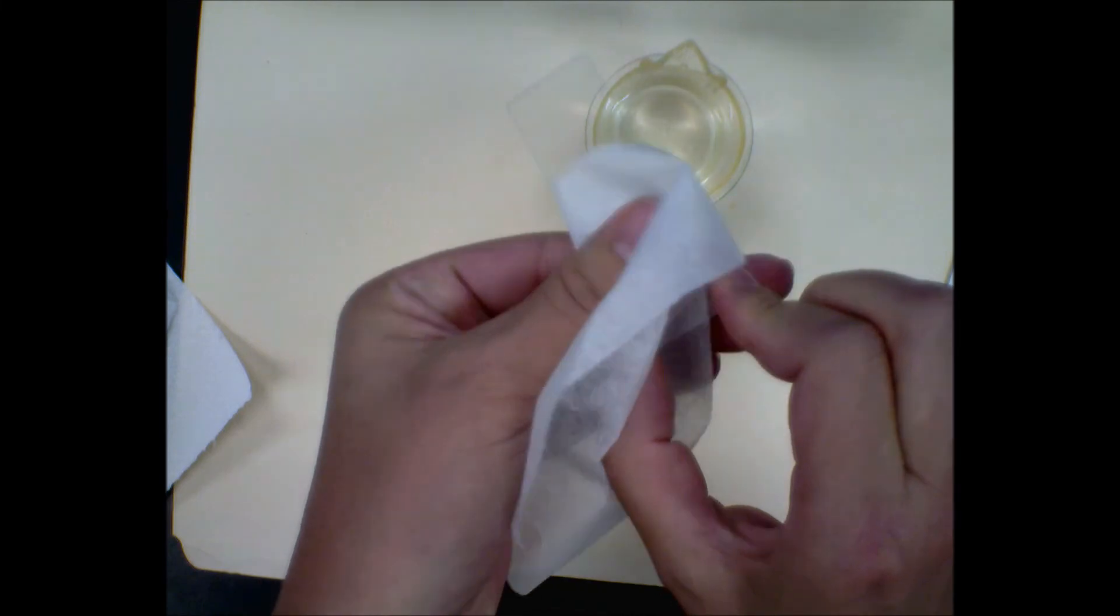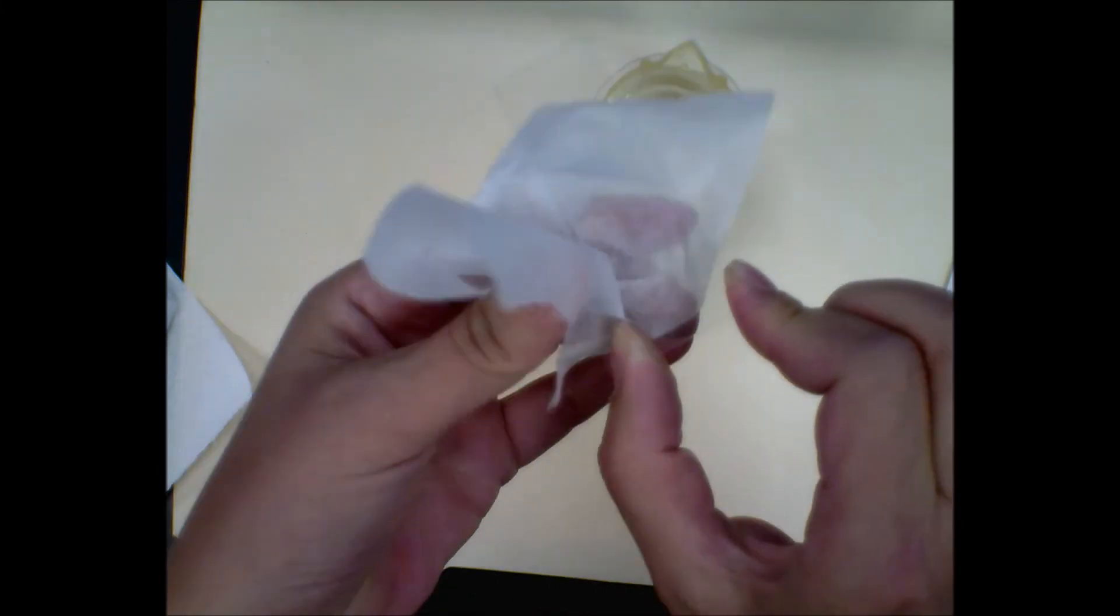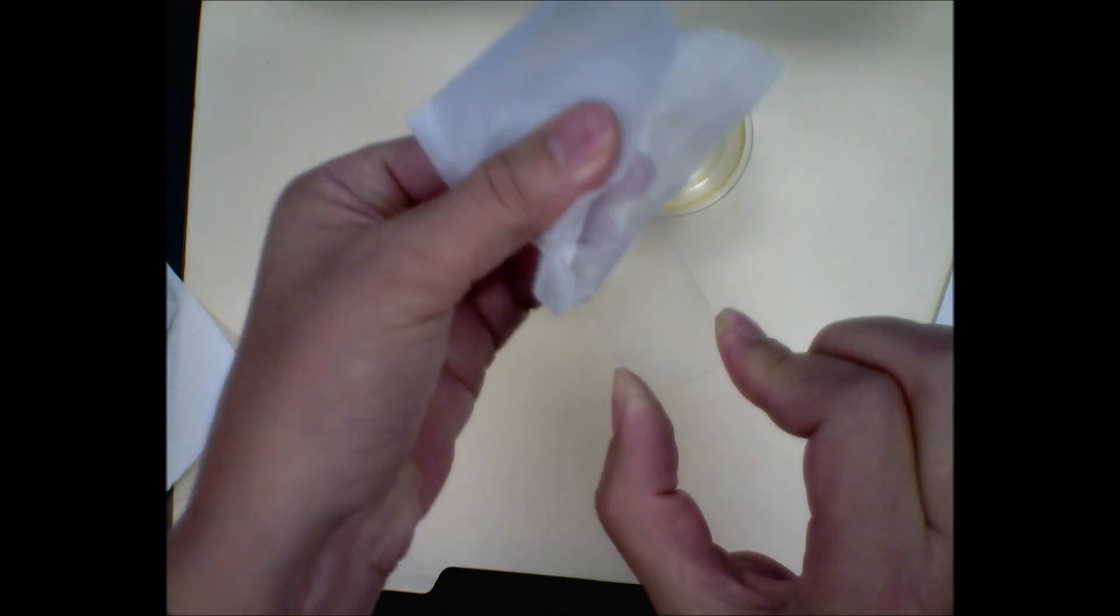Again, when you are done, you do the last bit with lens paper. Make sure you don't have your fingers on it, because then you just smear a bunch of oil on it.